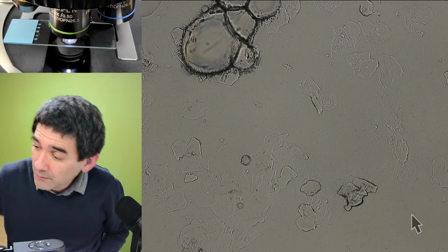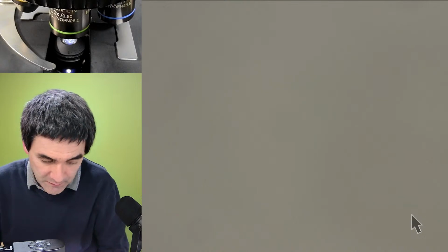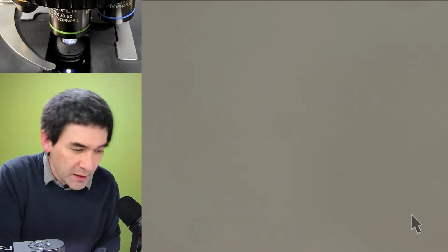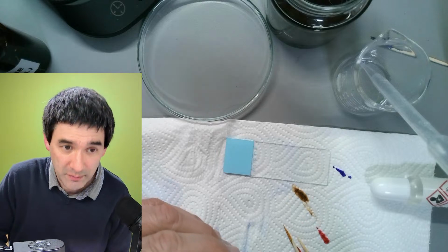Okay, so I'm going to now do the following: simple stain again using crystal violet. Let's put away the coffee warmer. And now I'm going to do that, what was requested. After every step, I'm going to put it under the microscope, because I've also not tried this with my saliva before.